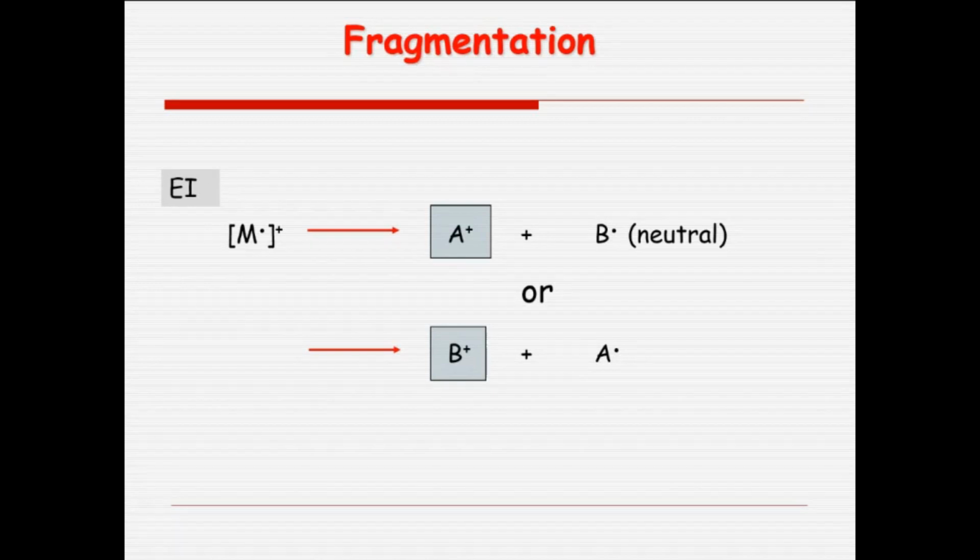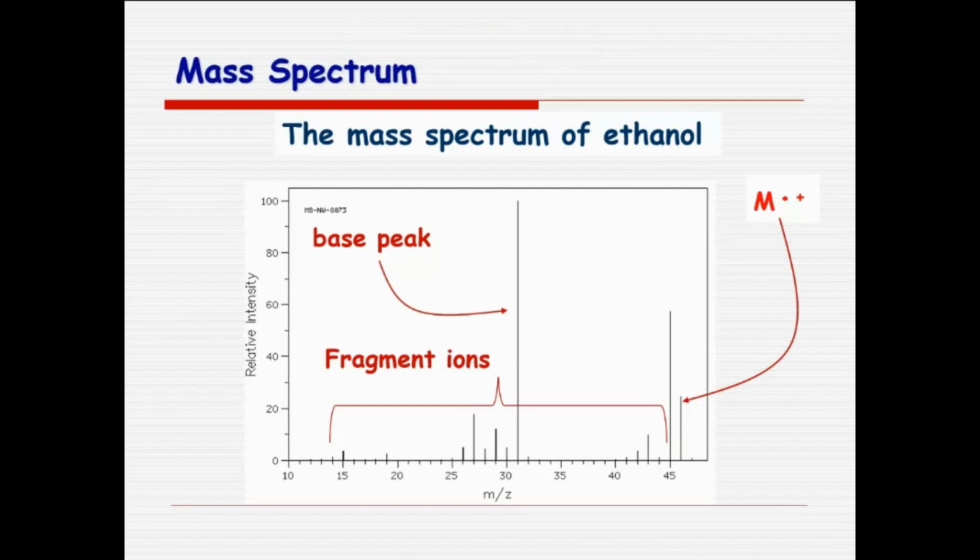So generally a highly branched system will not give a very strong molecular ion peak, and sometimes it will be invisible in the mass spectrometry. Keep that in mind. It is not necessary that the molecular ion peak appears every time.